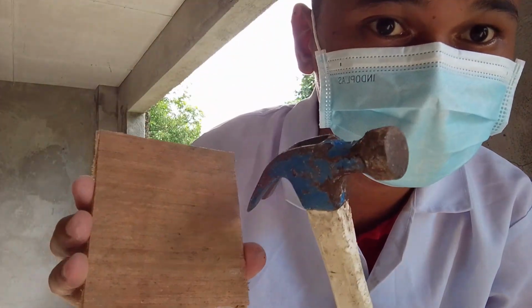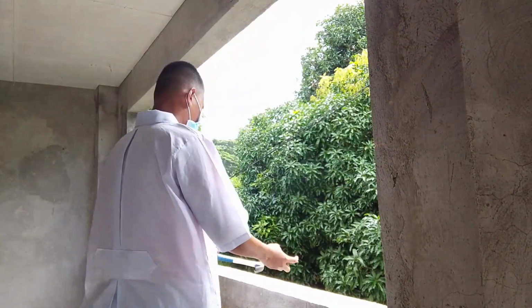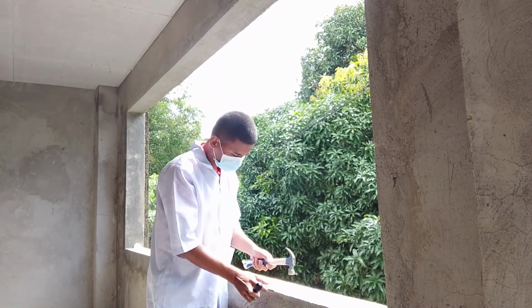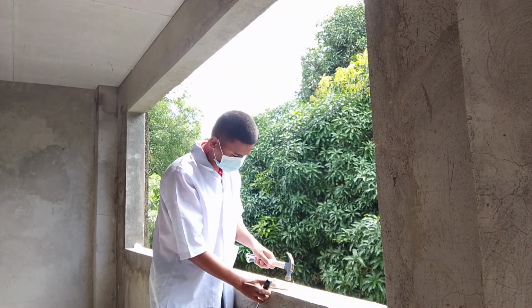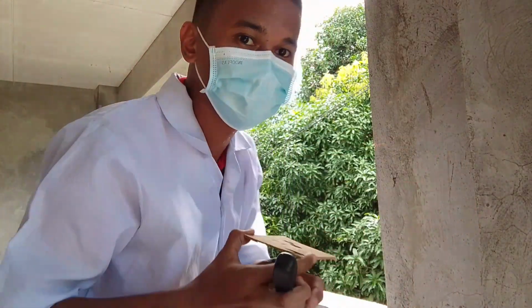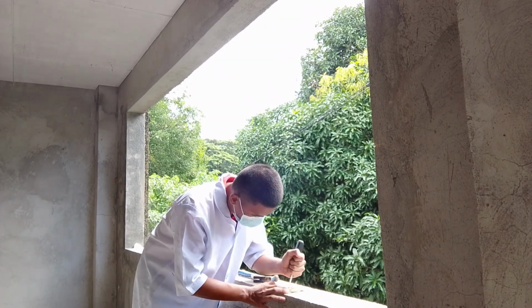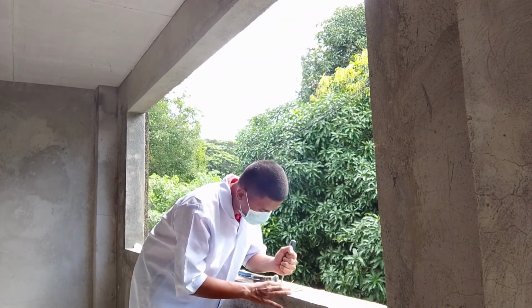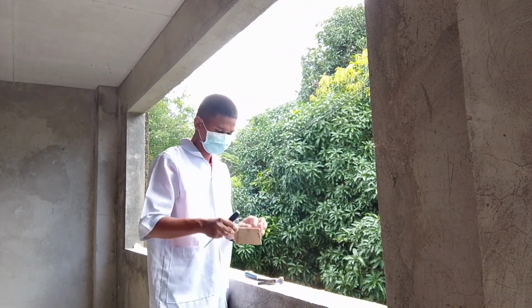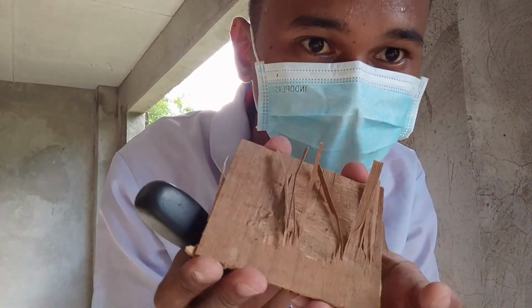First, I will put a negative impression, followed by an abrasion or friction mark. As you can see, it is a combination mark.